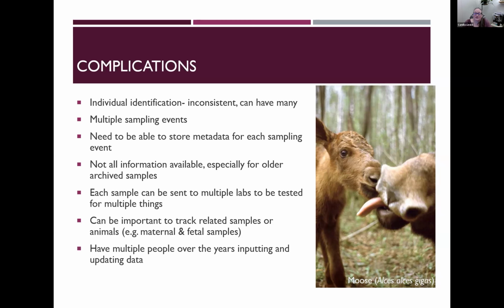And so that ability to understand that all of these things are actually the same sample and having that consistency is really important, but also being able to maintain the ability to know what those vials are actually labeled as, so that if we're doing a search and in our database it says it should be one thing and the label says something slightly different, so that people who may not have a great depth of knowledge of, say, the biology, that those things may be the same, that they have a way of double checking that the label matches what the actual sample type is.